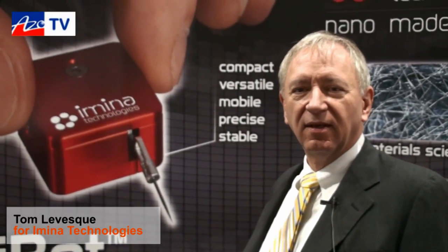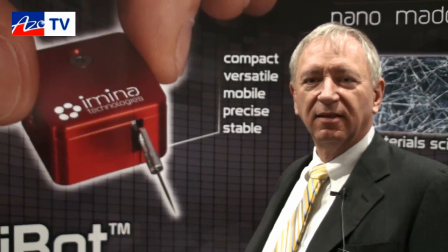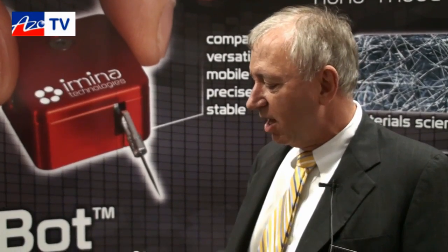This is Cameron Choi bringing another episode of AzoTV, and I'm speaking to Tom Levesque, who's working with Imina, and he's going to tell us about their miBots. I do have the pleasure of working with Imina Technologies on some really novel products.